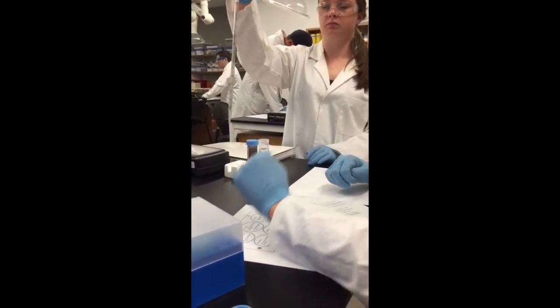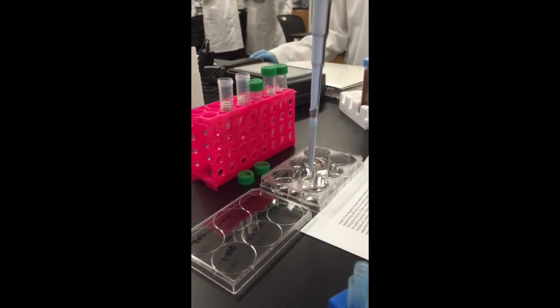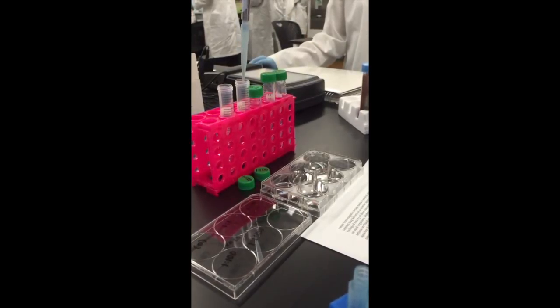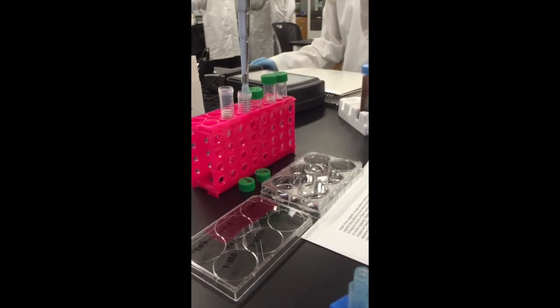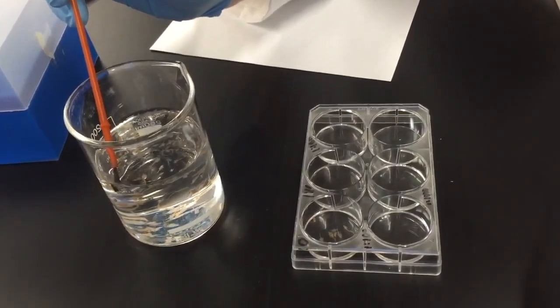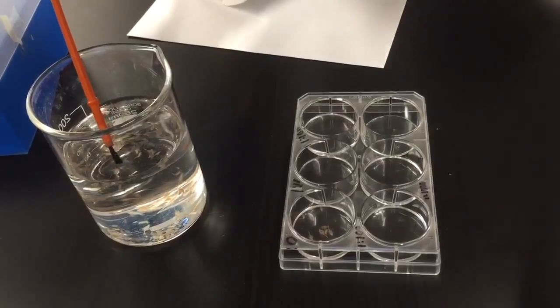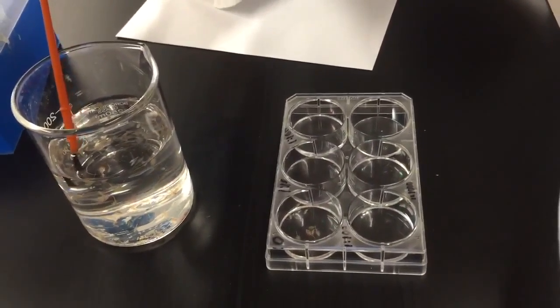To test this hypothesis, 5 test wells that contained different concentrations of nanoparticles in seawater were used as environments for the shrimp. Each well was labeled according to the concentration. The ratios of seawater to nanoparticles included 0, 1 to 1, 1 to 10, 1 to 100, and 1 to 1,000. After the test wells were loaded with the different concentrations, 10 brine shrimp were placed in each well. The brine shrimp were then observed periodically over the next few days in order to record observations.